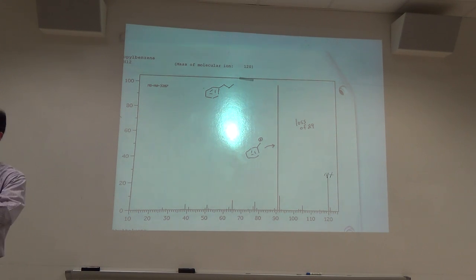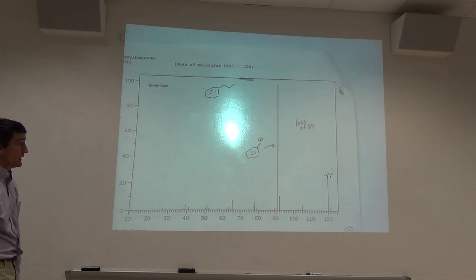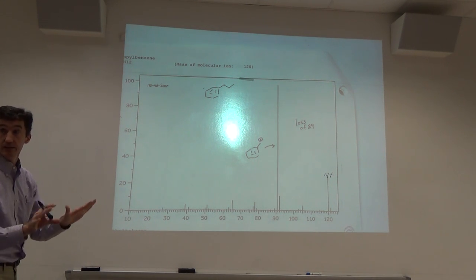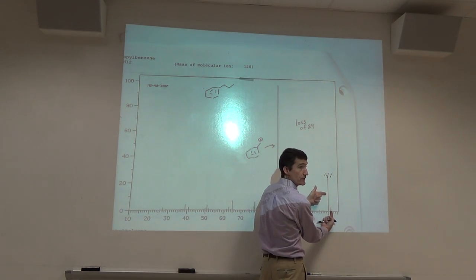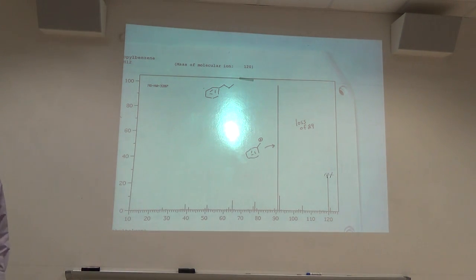We'll have molecules with 9 carbons all being 12, or you may have molecules with 8 that are 12 and 1 that is 13. Both molecules are hitting the detector, but you're just getting one scan, one read. This is 2 different molecules. One molecule can't give both molecular ions. It's 2 different molecules being present, one of them having 1 C13.